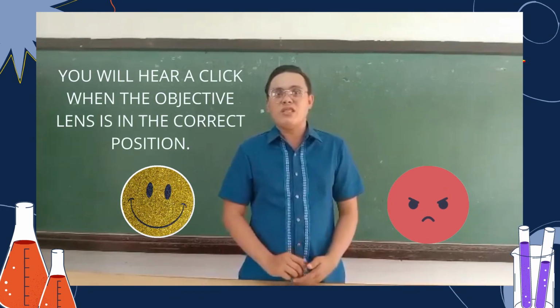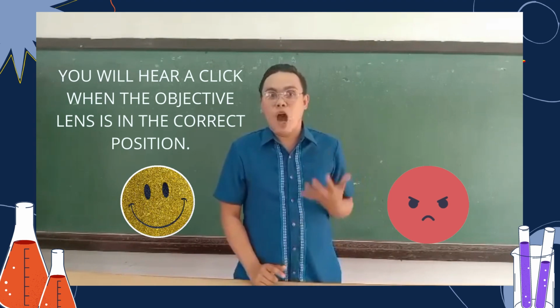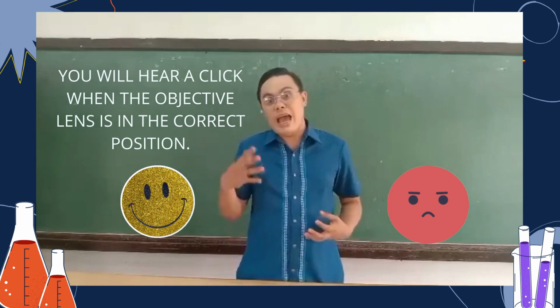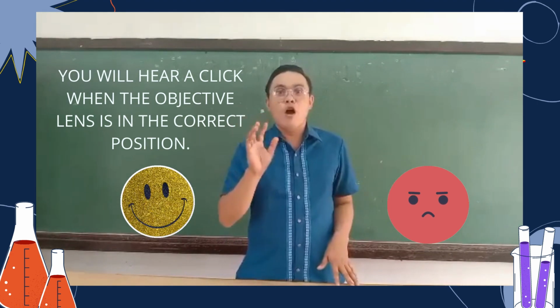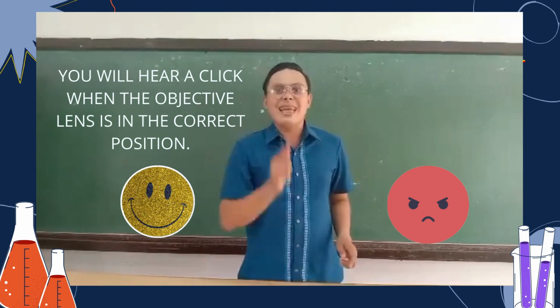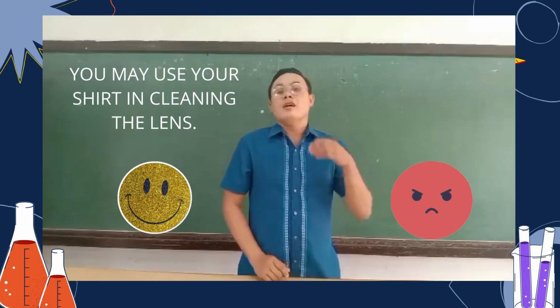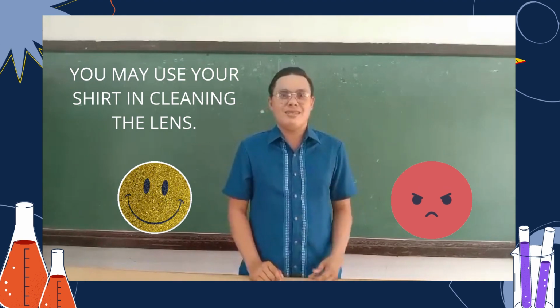Let's have the fourth question. You will hear a click when the objective lens is in the correct position. Is it in a happy or an angry face? In 5, 4, 3, 2, 1. Excellent! It's happy face! Let's have the final question, or the fifth question.